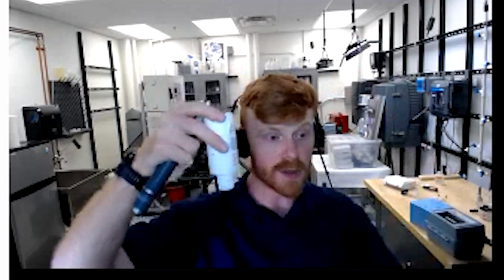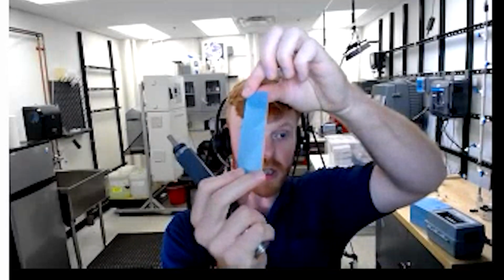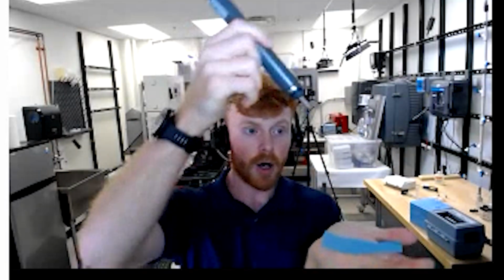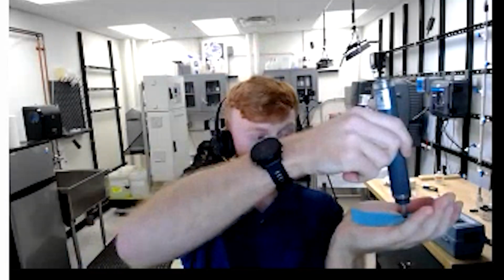with me here, along with my maintenance kit, which is my electrolyte and membrane cap. And really, the only thing I want to focus on is when you remove this cap, if you're changing out the electrolytes, go ahead and pour it all out and make sure you dry everything out to make sure old electrolyte has been removed. To polish my electrode tip, you're going to notice this blue piece of paper has a shiny side and a matte side. You're going to place that matte side face up on a hard surface. Now I'm just going to do several lines like I'm drawing with a pencil, and that should be good enough to polish my electrode tip.